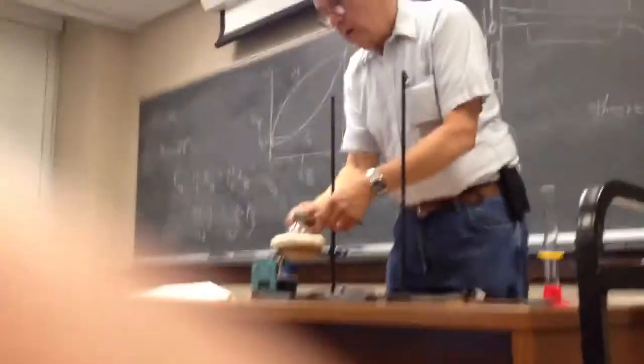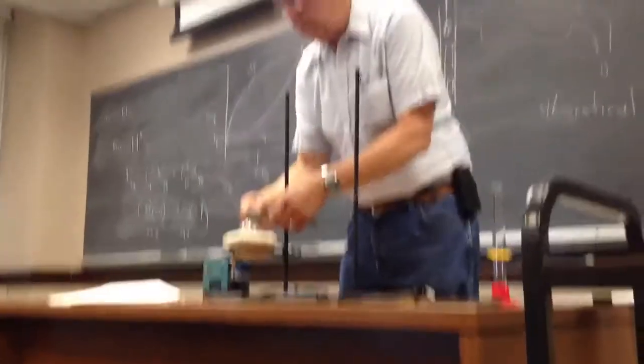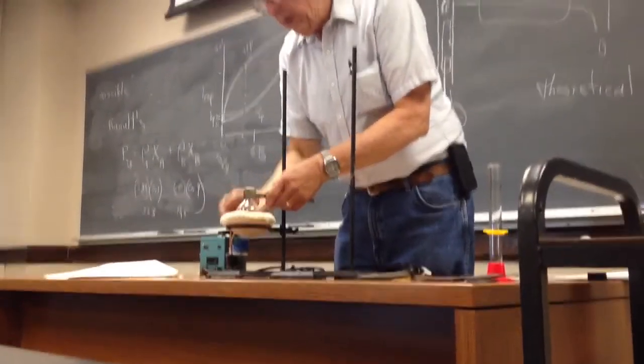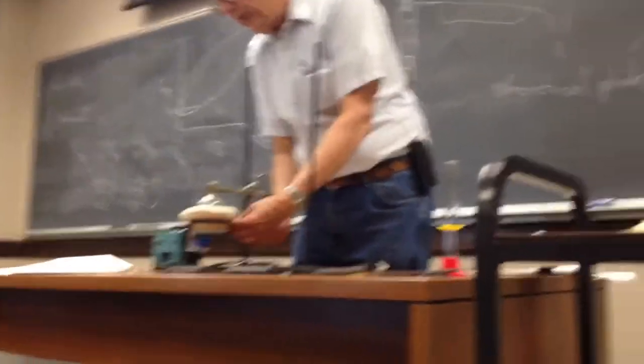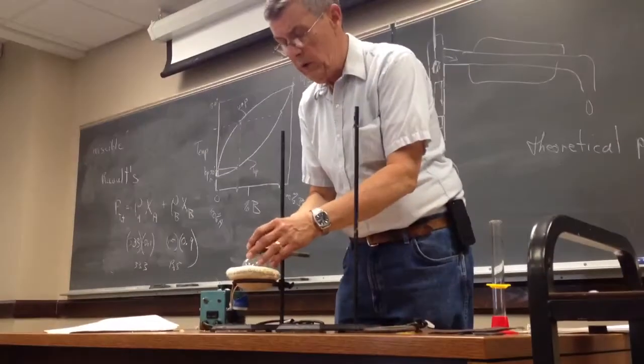Off of there, but it's not flopping around. That's what's going on here. There we go. Yeah, that's pretty good. And if I drop this, see, it's good shape. Okay. So I'll put my heating mantle back up, and I'm going to leave this set up for you.